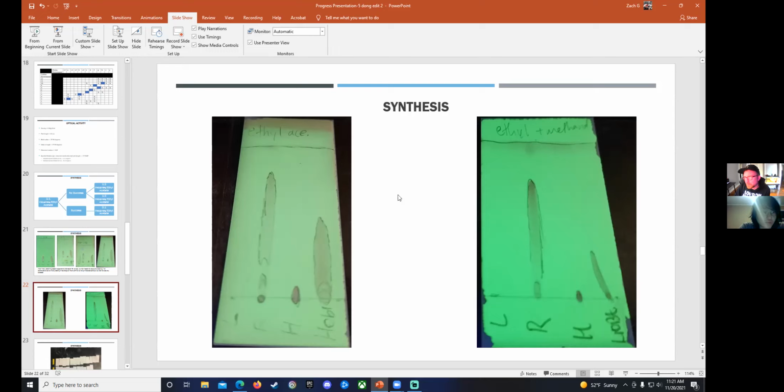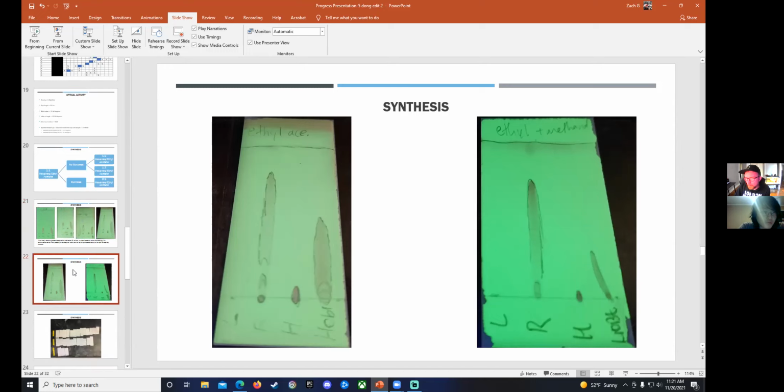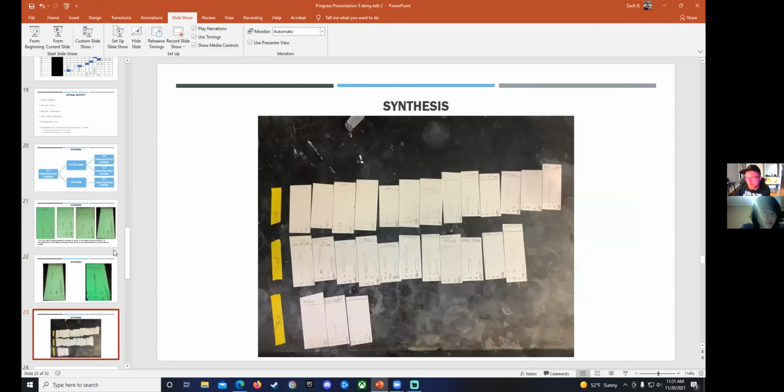Unfortunately, you probably couldn't tell much of a difference between the two. We tried it, but we could not get rid of the massive streaking at all. It was something we just had to work with and move on.